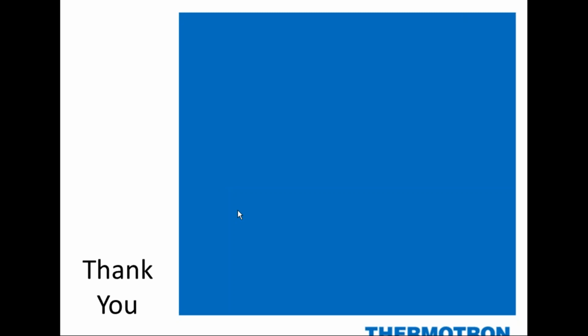So that goes back to generating humidity, and the way we do that is there's a heater in a tank of water. It boils that water, the water vapor goes into the chamber, and what gets left behind, the scaling that was asked about, is the impurities in the water.